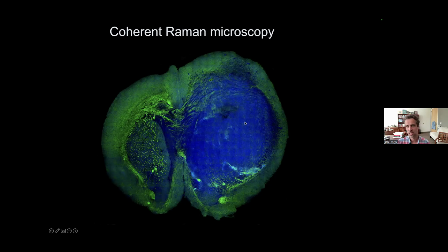So this image is gigantic, lots of data points. You could never take this in a regular Raman microscope, but the nonlinear optical microscope, way faster, allows you to take this, again, no labels, but still chemical contrast, okay?